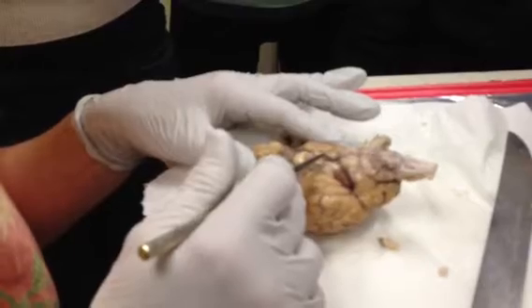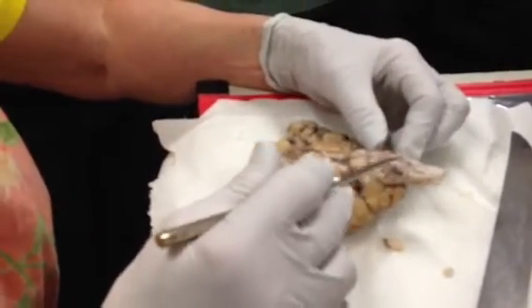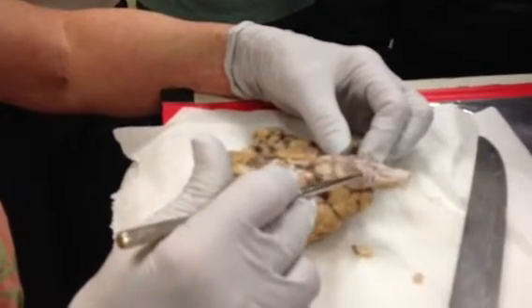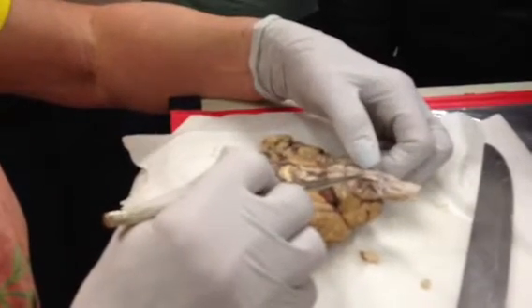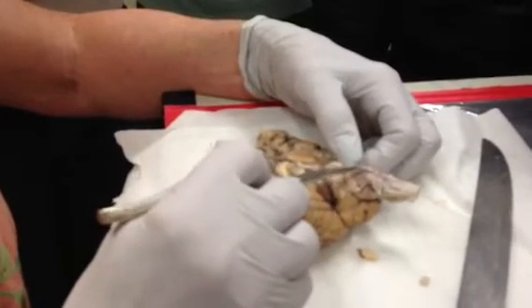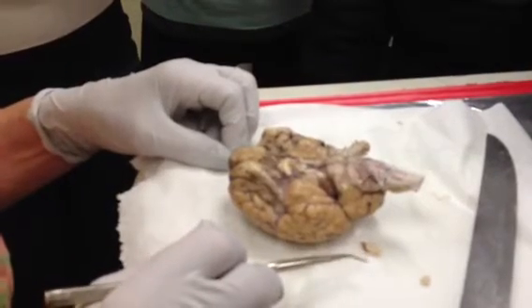Okay? Now, there's an important part on the medulla. Again, you can see some of the other cranial nerves, but we're not going to need to worry about them right there. But right here and right here, notice the bilateral raised ridges. Those are known as the pyramids of the medulla.